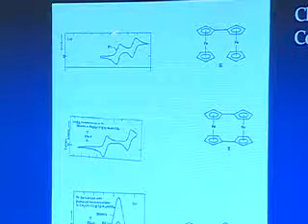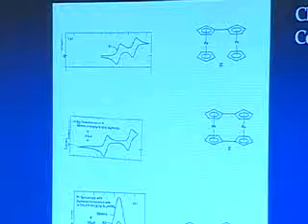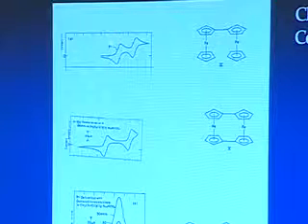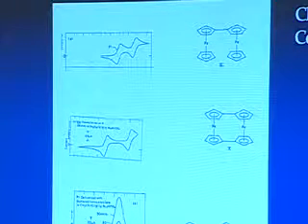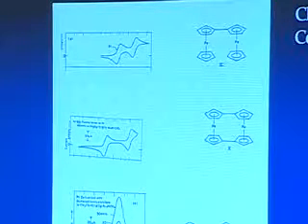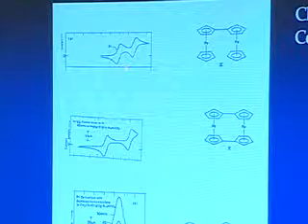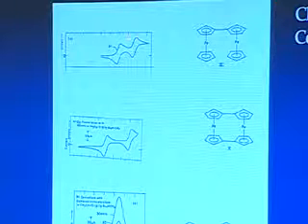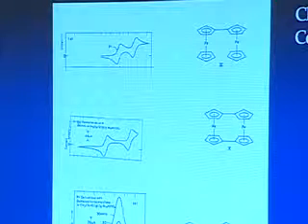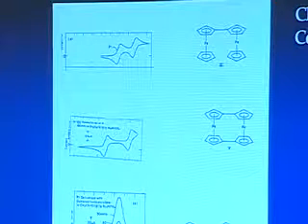So we started off with these 2 ferrocene units, hooked together just by a single bond there. Ferrocene oxidizes at about 0.25 volts versus SCE in acetonitrile, depending on exact conditions. And what we see now is 2 redox events. One of these ferrocenes oxidizes, and then the second ferrocene oxidizes at a much more positive potential. If the 2 centers were not in communication, they'd both oxidize at the same potential, and we would just see a single n equals 2, a 2-electron charge transfer.